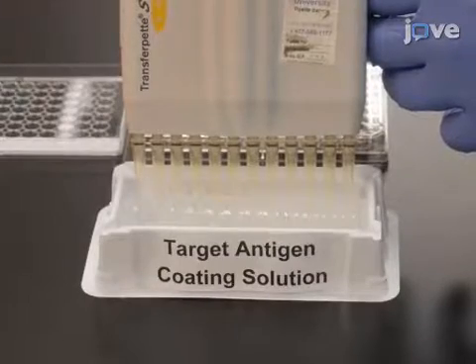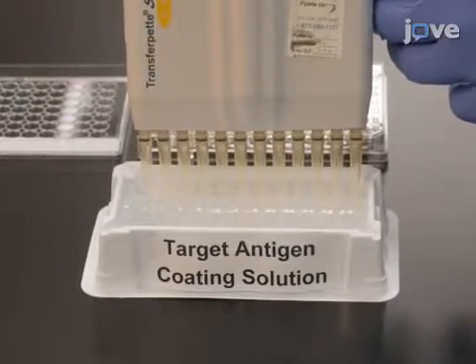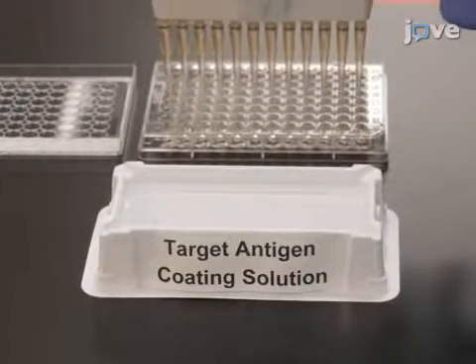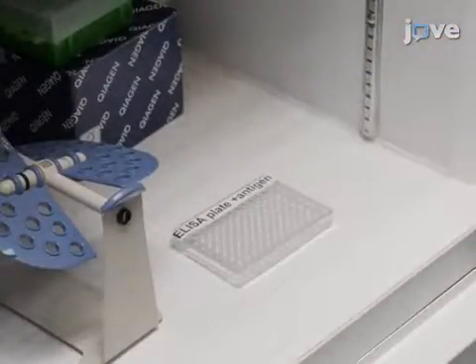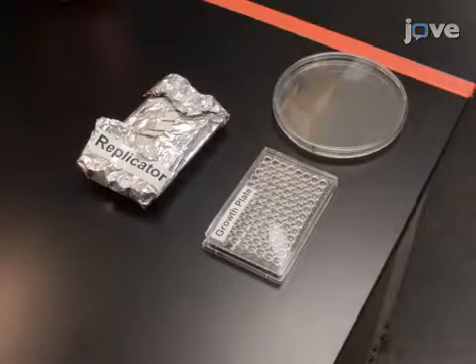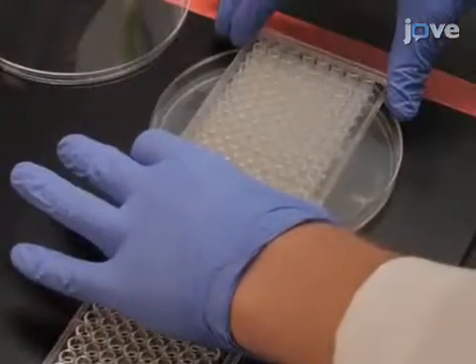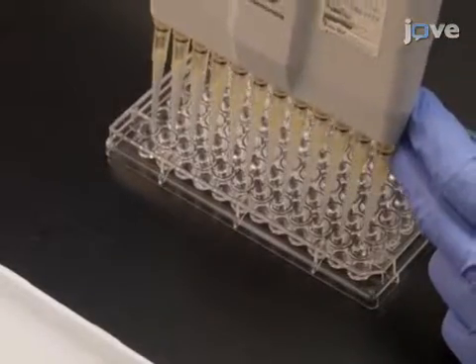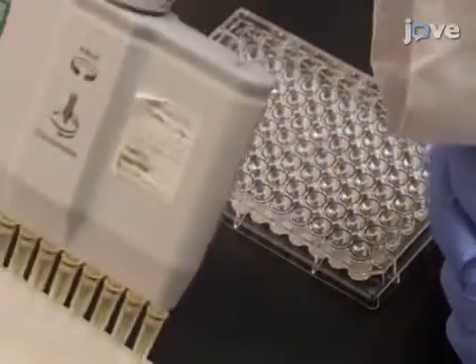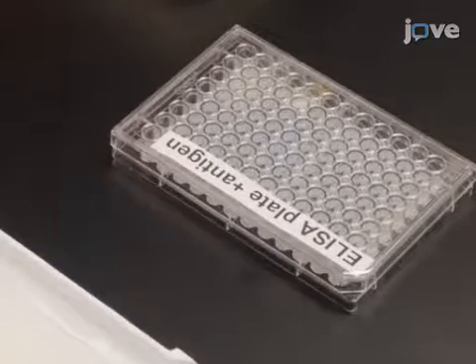After preparing a target antigen coating solution according to the text protocol, add 50 microliters of the solution to each well of a 96-well high-binding clear polystyrene ELISA plate. Incubate the plates at 4 degrees Celsius overnight. Next, replicate the colonies from the 96-well culture plates onto agar plates according to the text protocol. Empty the coating solution from the ELISA plates, add 100 microliters of blocking solution to each well, and incubate at room temperature for at least 2 hours or at 4 degrees Celsius overnight.